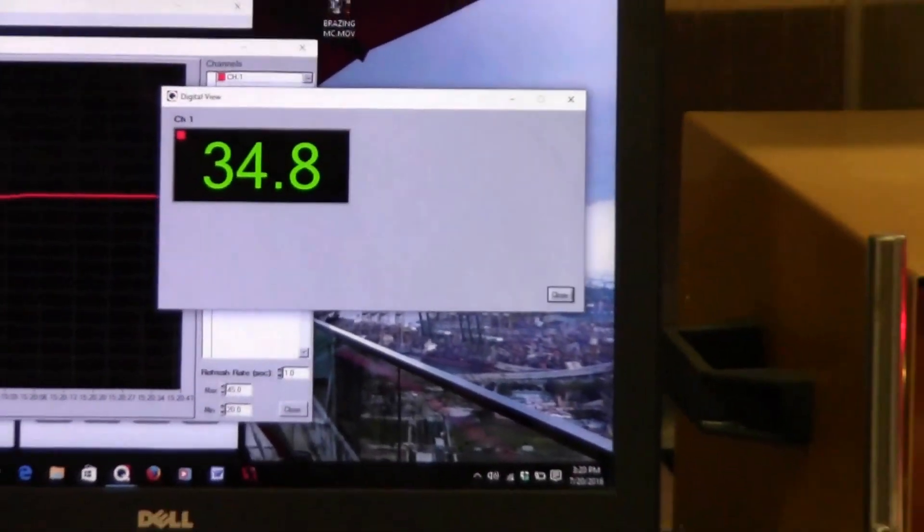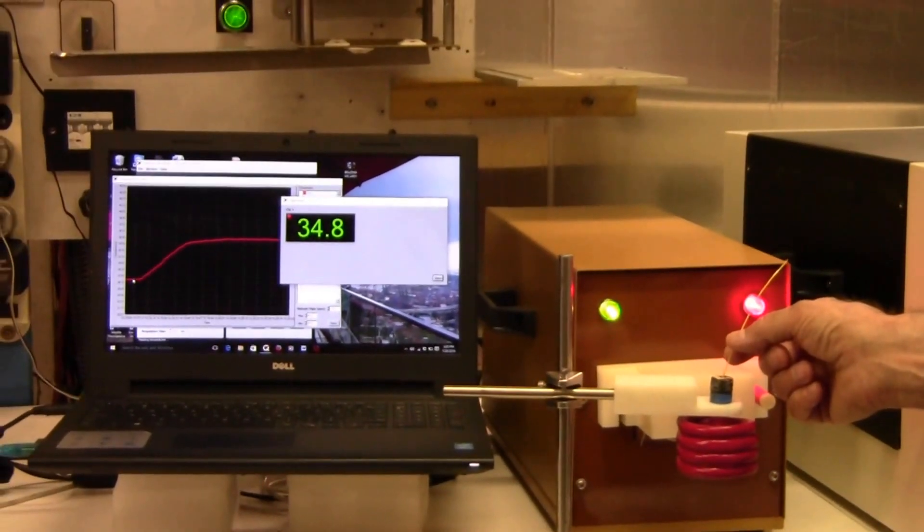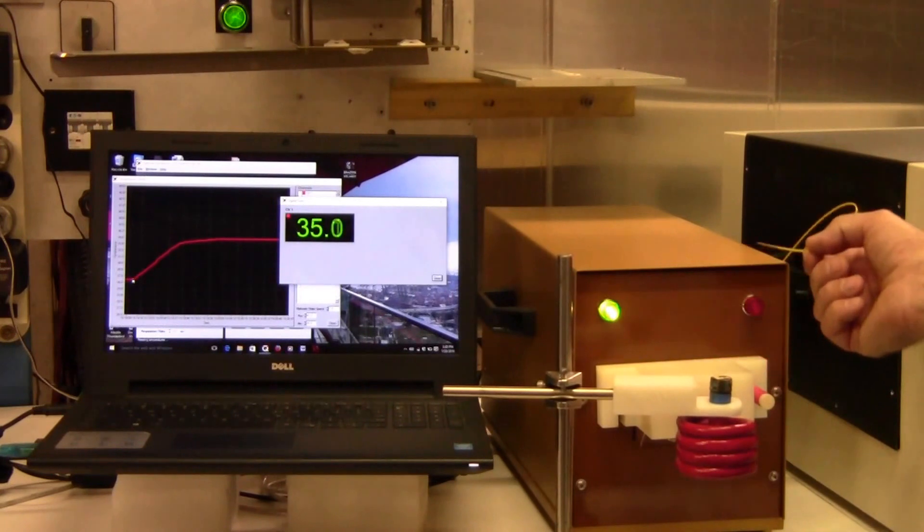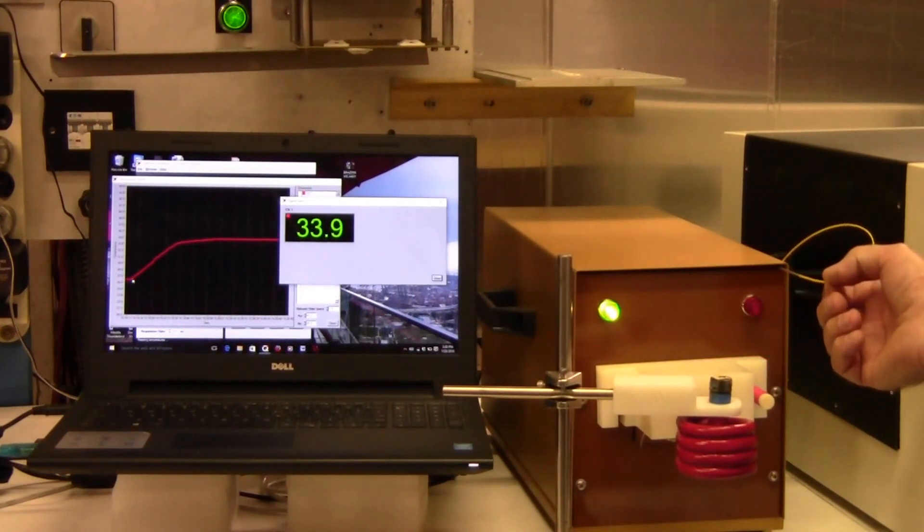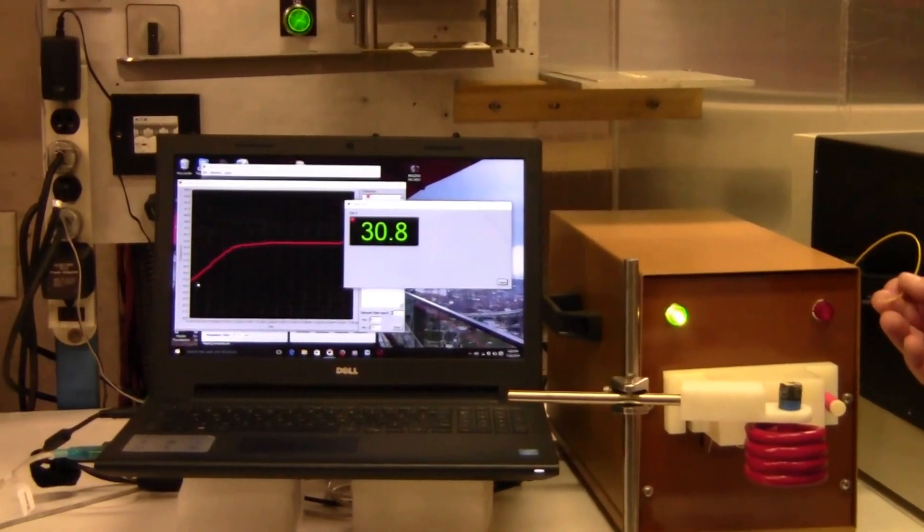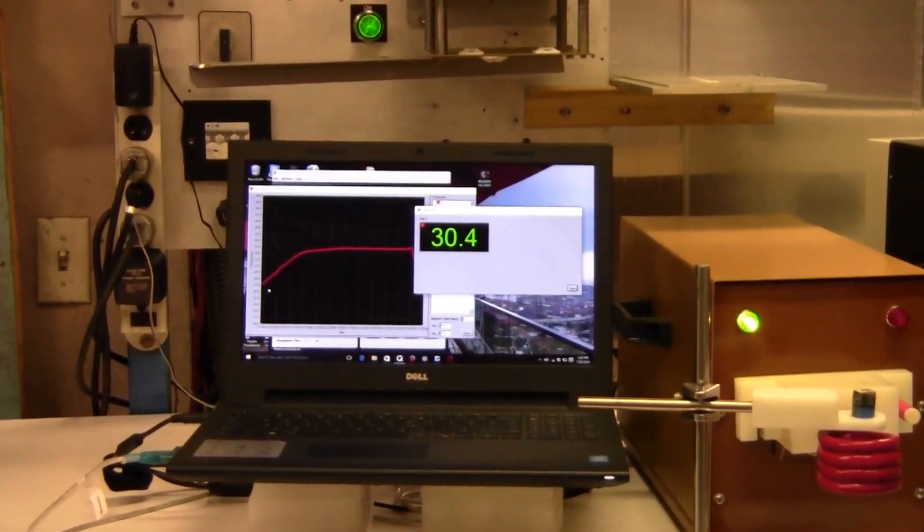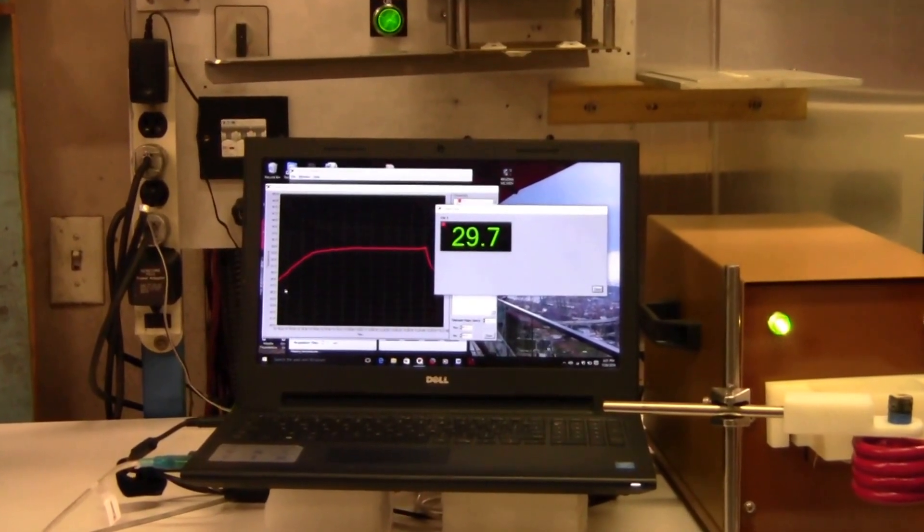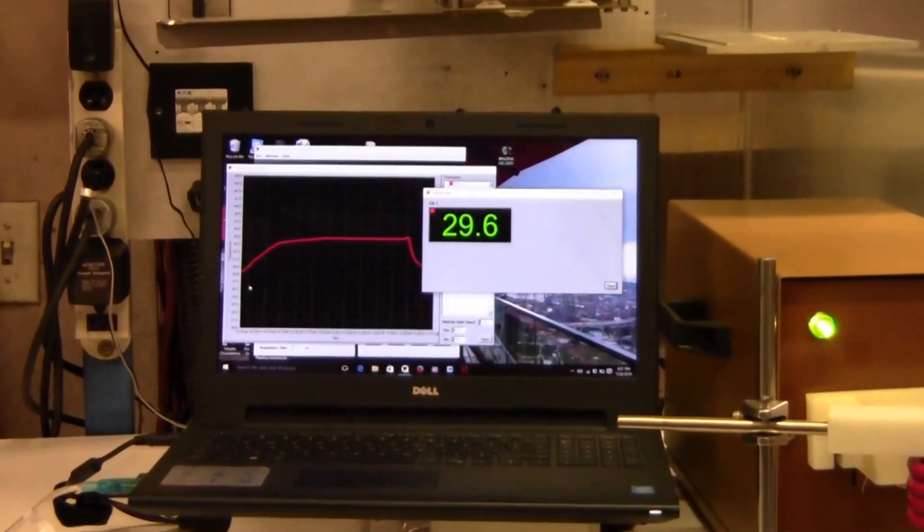And I'm going to pull the fiber optic sensor out of the nanoparticles, and we'll go right back to the room temperature, and we'll see the profile drop like a rock.